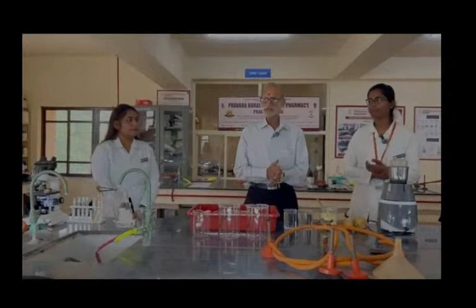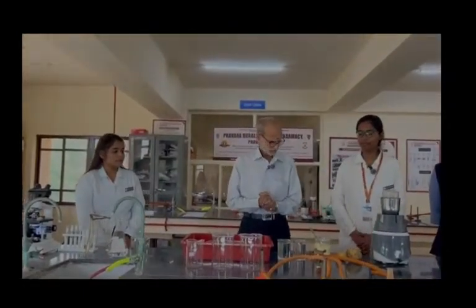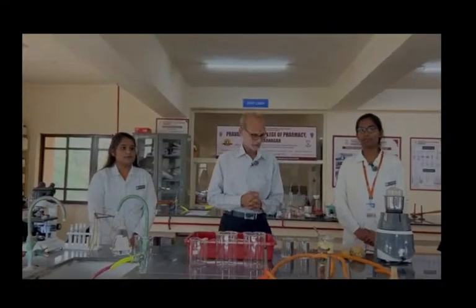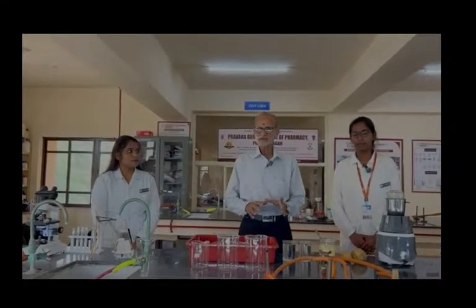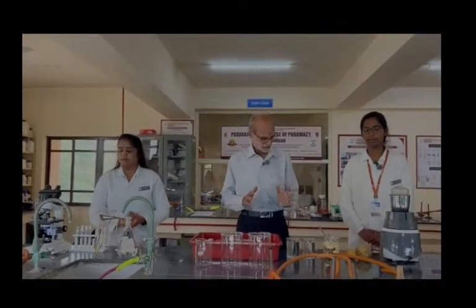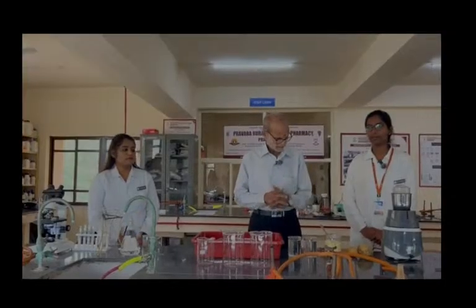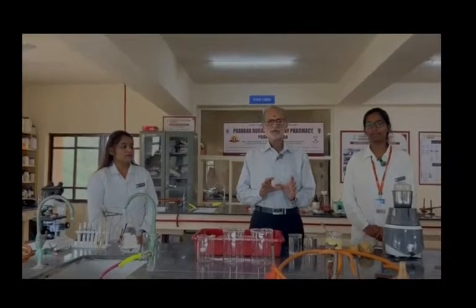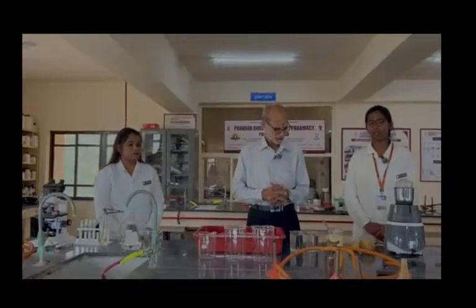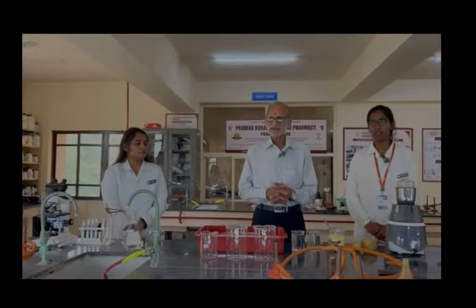We are going to begin with the very first experiment, that is separation of starch from potato. Let me give some idea about the starch. Starch is extensively used in the industry, whether it is food industry, pharmaceutical industry, or textile industry, or the paper industry. So starch really has good importance in the society, and we are going to begin. There are three important starches. Number one, and most widely used starch is a cornstarch. Number 2 is a potato starch, and third one is a tapioca starch.